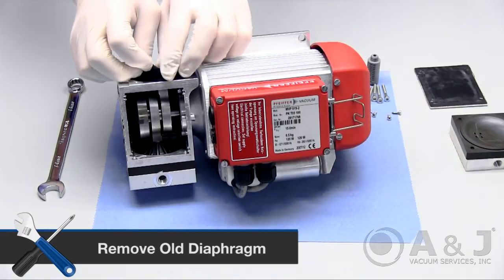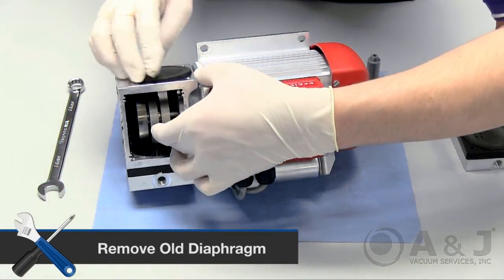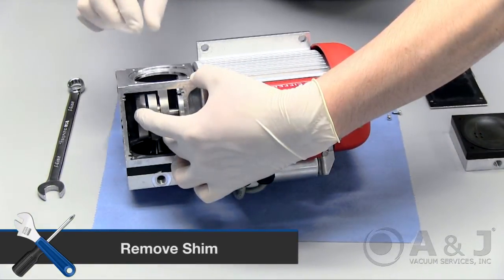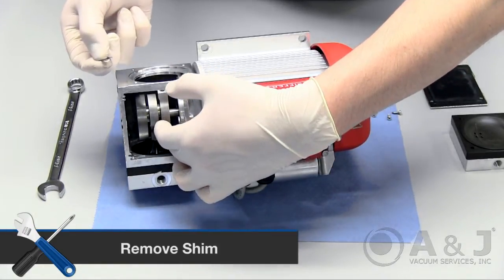Flip up the sides of the diaphragm and unscrew with your hands. Put the shaft in the highest position to get better access to the old diaphragm and securely remove the shim. Place the shim to the side.